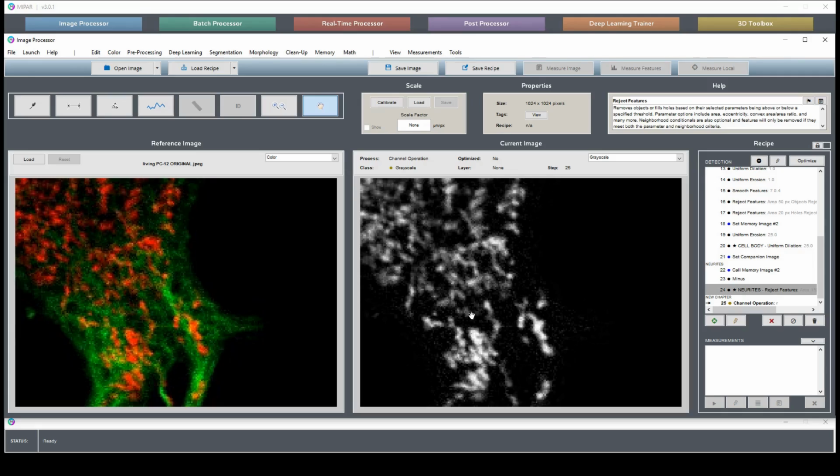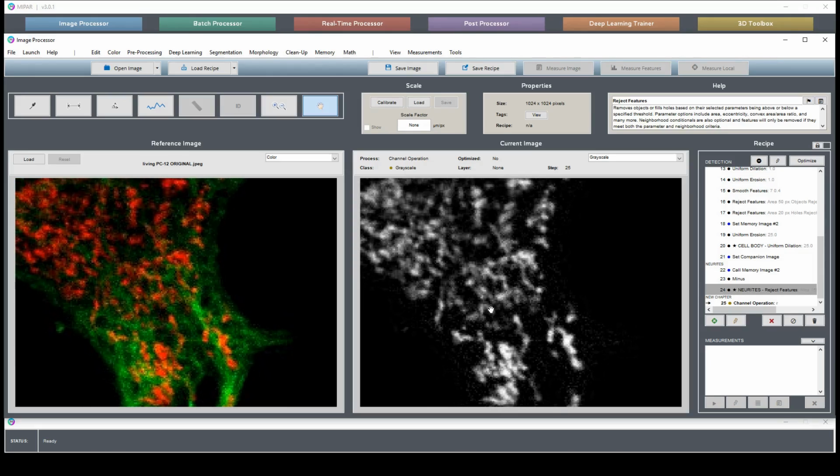In which case, yes, you would measure the grayscale intensity of the red channel that is present in each of these segmentations. In our case, we care about the amount of mitochondria itself, not the amount of staining on those mitochondria. So rather than using the grayscale value, we're going to segment the mitochondria, turn it into a simple yes, no, there is mitochondria in this pixel or not, and then measure that within each of these regions of the cell.